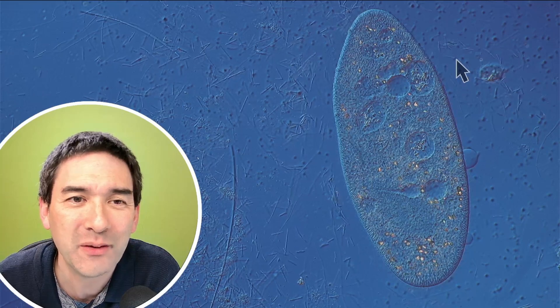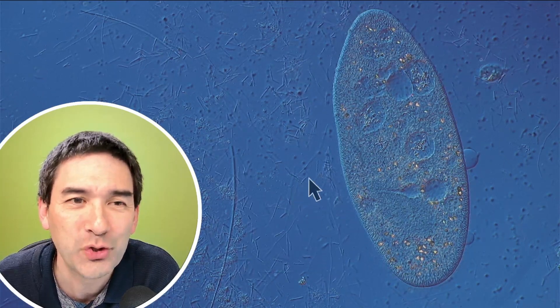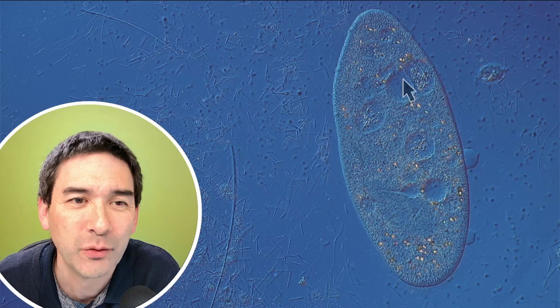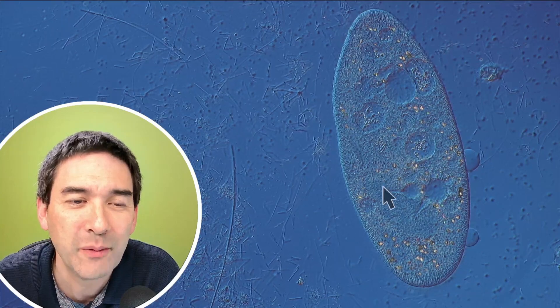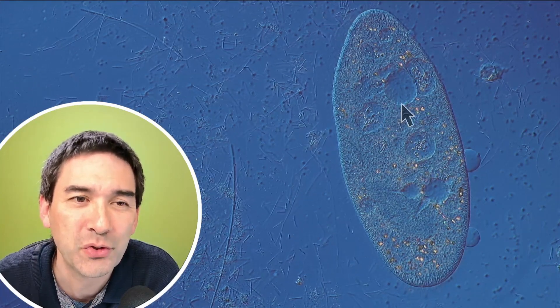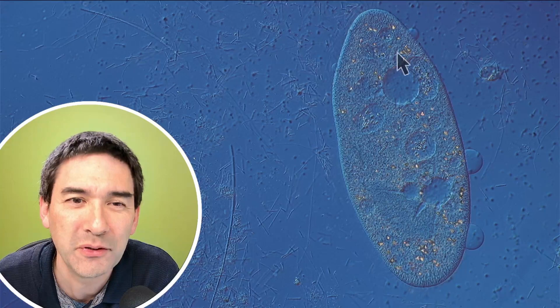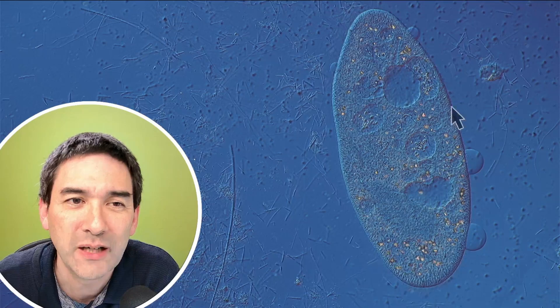We're now looking at the cell with the 40 times magnifying objective. You have plenty of cell organelles visible in here. We can see a lot of bacteria also on the outside here. Those rod-shaped structures are all bacteria. Let's have a look at this one over here. These are vacuoles that contain either food, and some of them might also be—there should be also two contractile vacuoles visible, which are pumping out water.